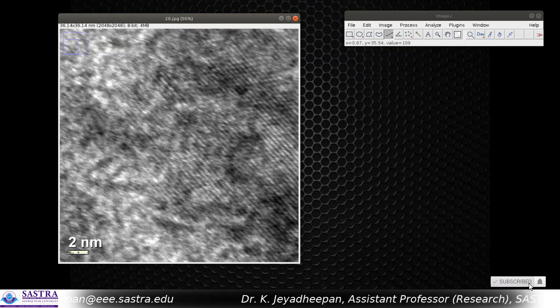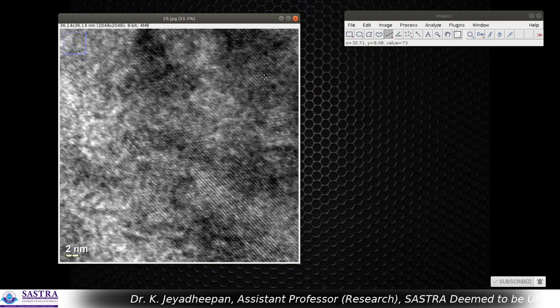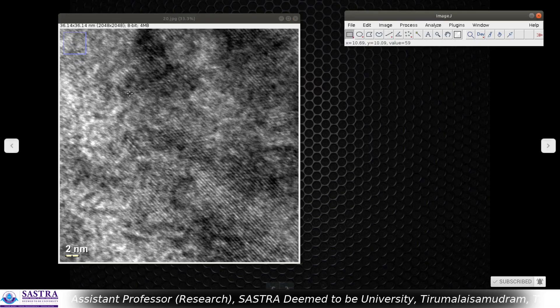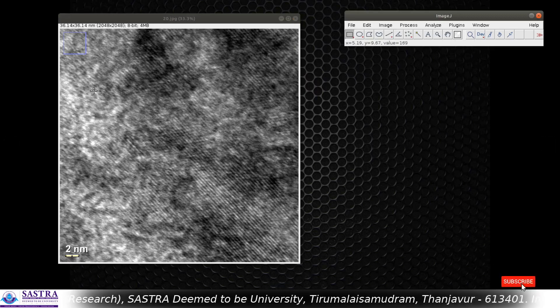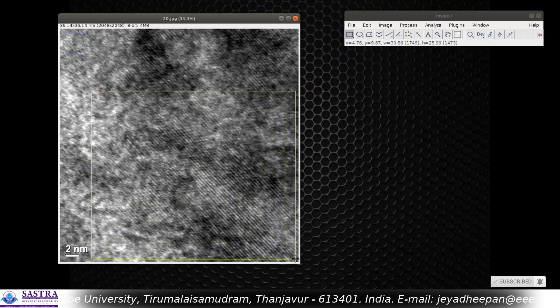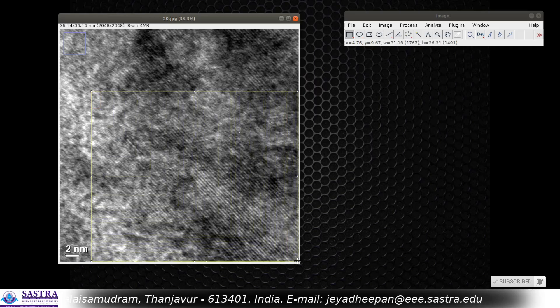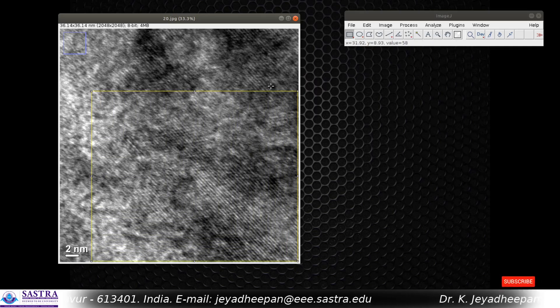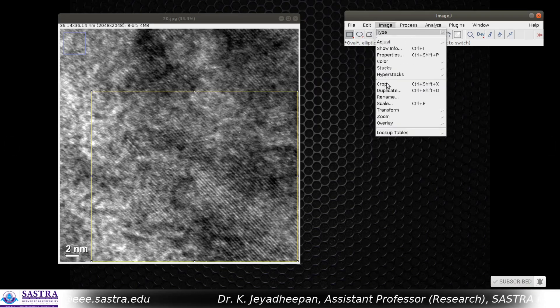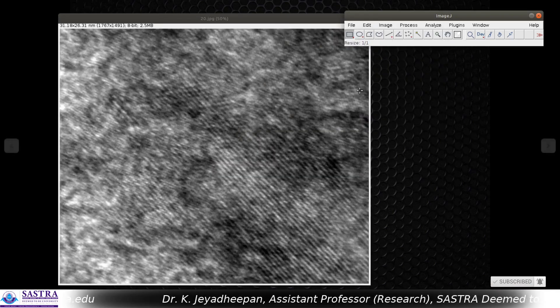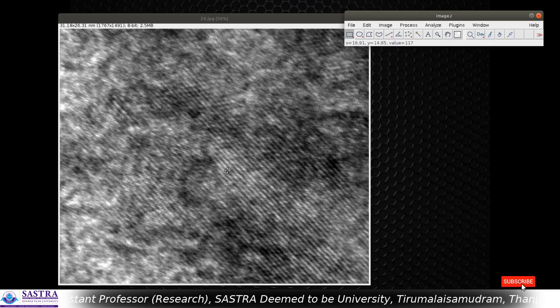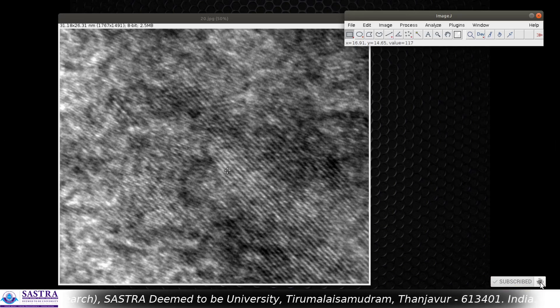Now I am going to unzoom the image and take the rectangle tool to select only the region in which I am going to find out the D-spacing. Then go to Edit, then Image Crop. Now we have selected only the area in which we are going to determine the D-spacing.